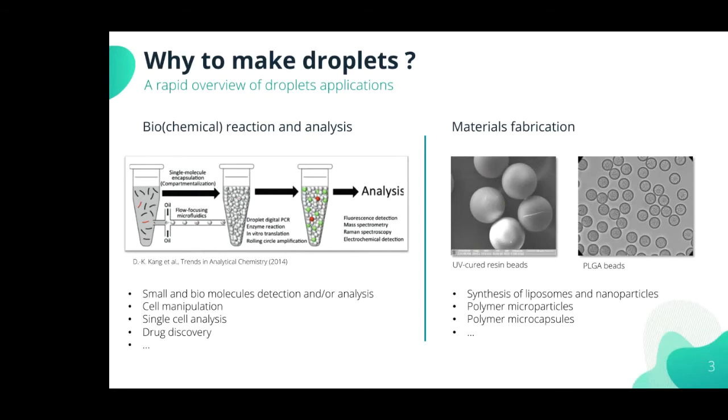For material fabrication, droplet microfluidics is a very adaptable tool for the generation of nano or macro-sized particles. In nanoparticle synthesis, the precise control of reaction kinetic and thermodynamic parameters allows the production of nanoparticles with a tunable size. And in microparticle synthesis, because the droplets are generated in a highly controllable way, the production efficiency and particle monodispersity are much higher than with conventional emulsification methods. In this category, we find synthesis of nanoparticles and liposomes, polymer microparticles and microcapsules for drug release, etc.